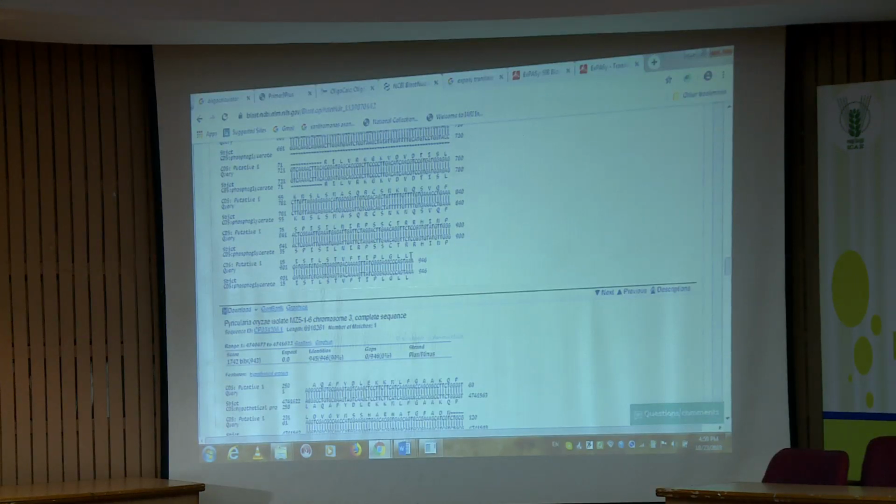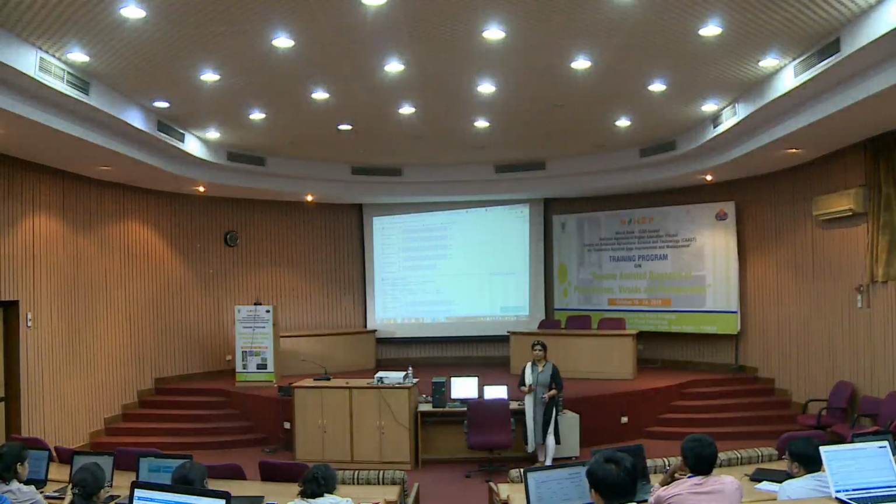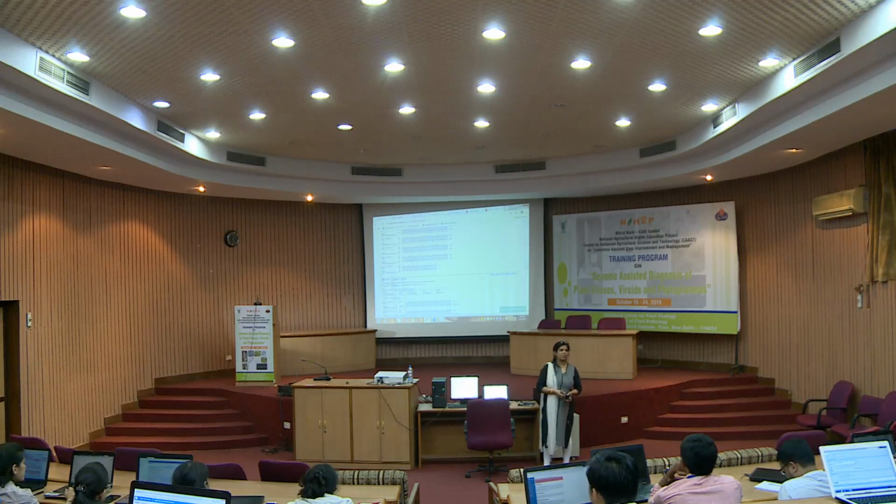I think you can submit. I haven't done it, but I think you can submit. Those are the different formats. The information you will be submitting is the same, only the set of instructions you have to follow is different, right? Any queries regarding that, any confusions? Try this after going back from here, otherwise you will forget everything. That happens with anyone.